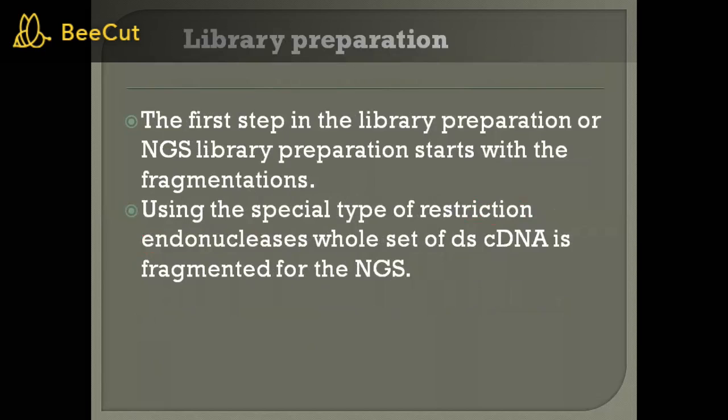By using that reverse transcription, we can get many fragments of cDNA molecules, because earlier we have carried out the digestion of that particular RNA molecule.